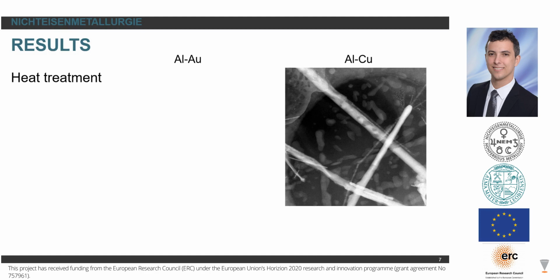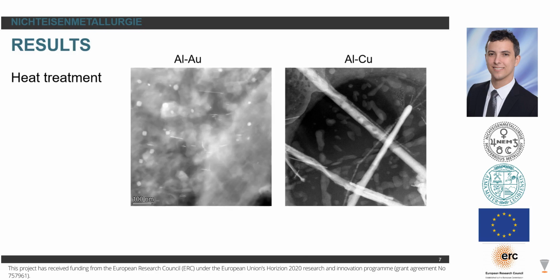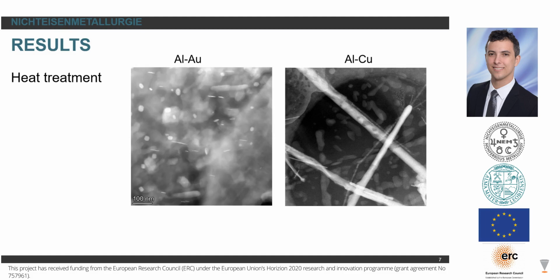So here is the picture right after melting, and then right after the heating began at 260 degrees Celsius. The heating, by the way, was done instantaneously. We see the formation of needles everywhere, and we see that a transformation is occurring, which is a good sign of alloying. When we go along, about 1 hour later, we see growth and breakage of some needles, and the same behavior is also observed after 2 hours of experiment.